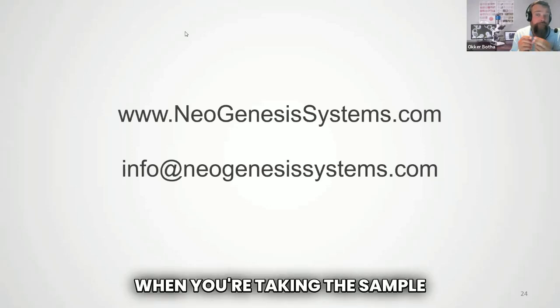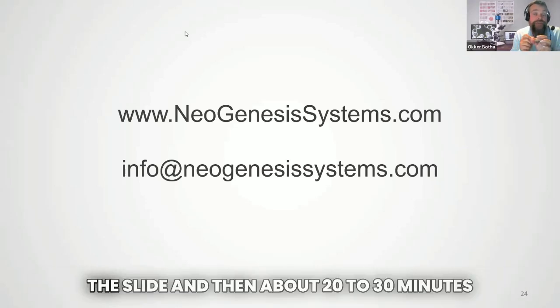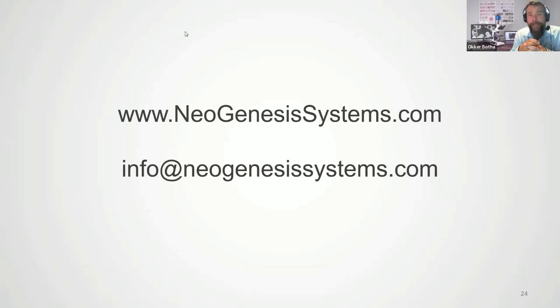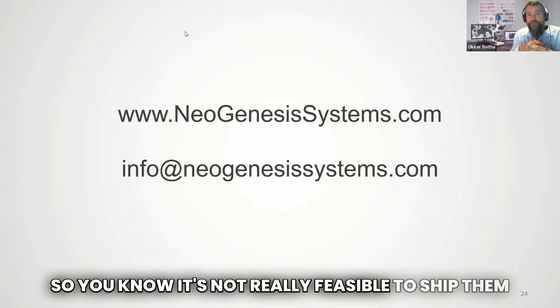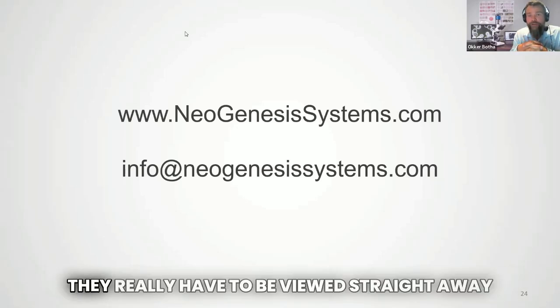When you're taking the sample from the finger, you have about 15 seconds to collect the sample onto the slide, and then about 20 to 30 minutes to view the live sample. So it's not really feasible to ship them around and view them later on. They really have to be viewed straight away.